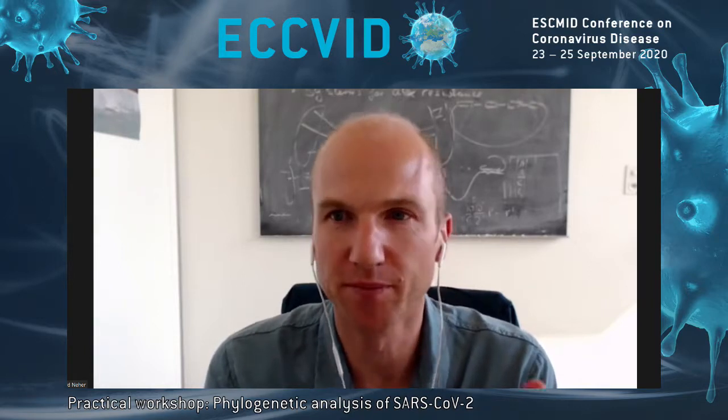Yeah, so we've pretty much ended the formal part of this practical session. Now we are around to answer more questions. We'd also possibly answer more questions live as they come in, and maybe hop into screen share to address some particular points. One thing, for example, that I forgot to mention is that Nextclade also flags mutations that fall into particular sets of diagnostic primers.